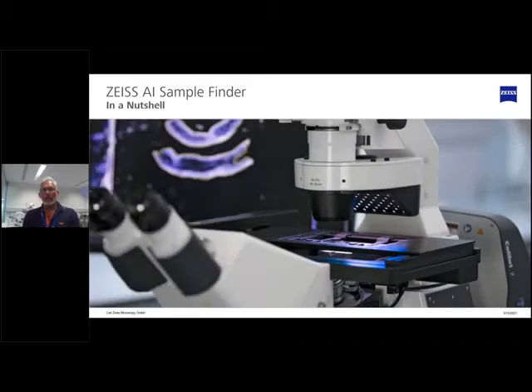And that's the way it looks if you enter such a setup. It consists of an inverted microscope, latest release, and you will see a multi-LED array at the back of your condenser. That's the one we use for giving us these unique dark-field contrast images to segment the carrier as well as the sample.